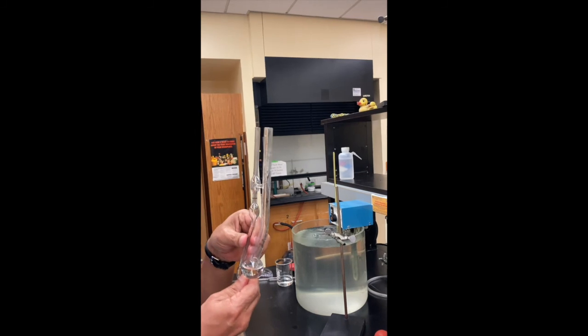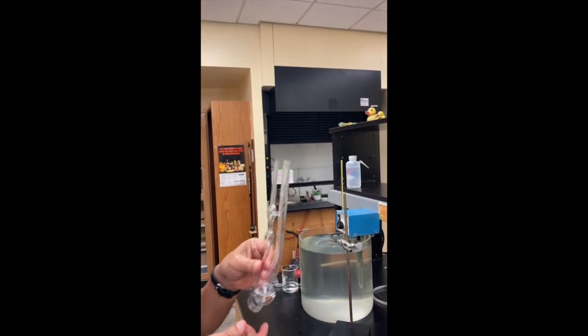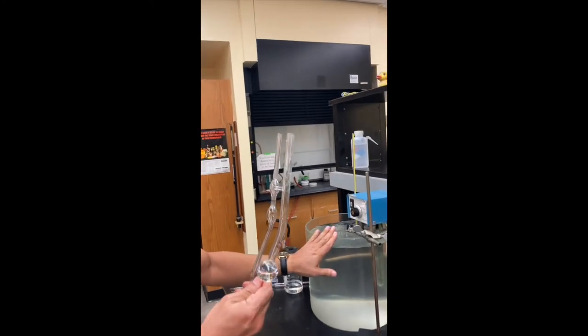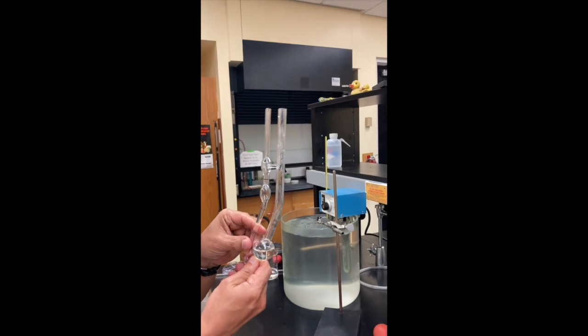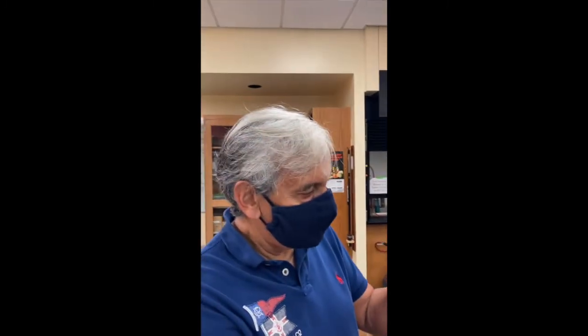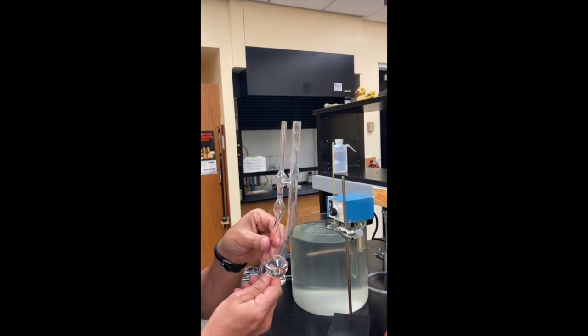So the key factors for the success of this experiment: first, maintaining constant temperature; second, keeping the viscosimeter clean, rinsing it with acetone between every measurement.